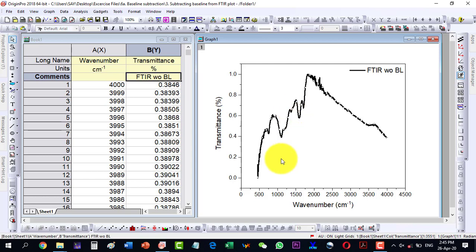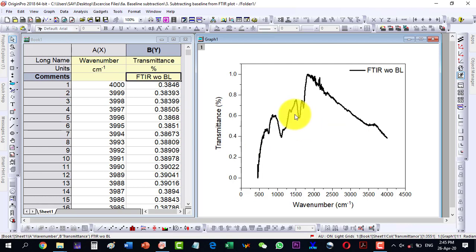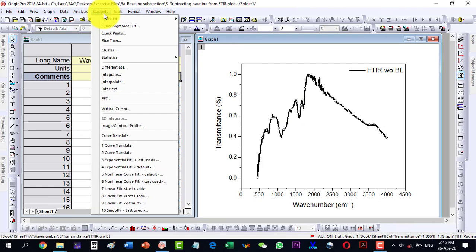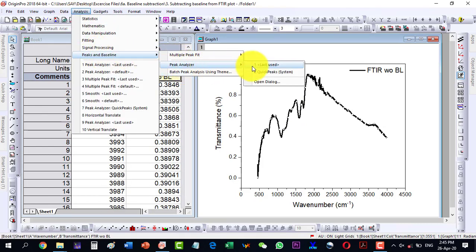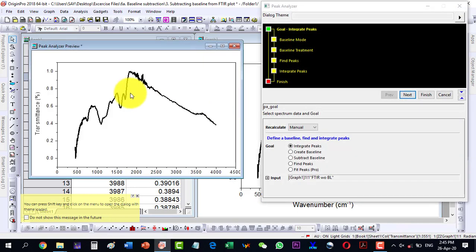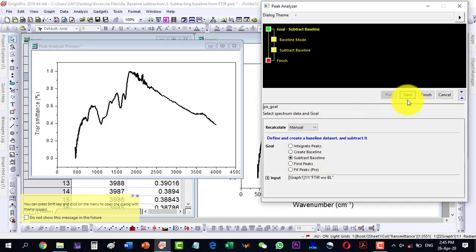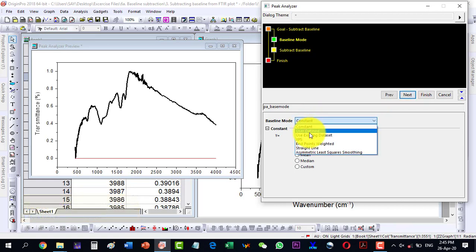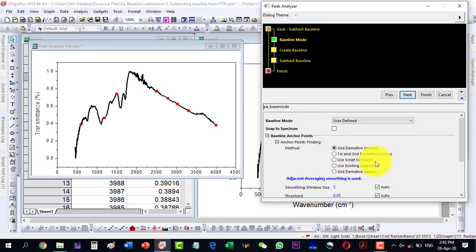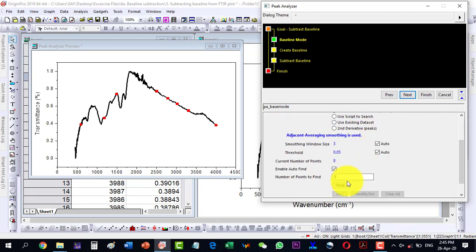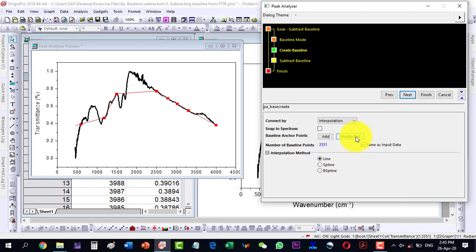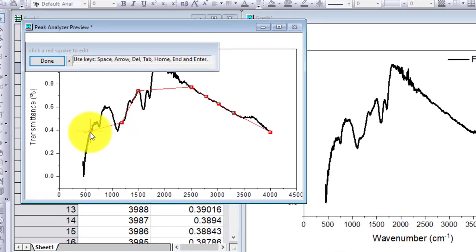Here is an FTIR plot and I would like to subtract the baseline from it so that this point and this point are on the same line. These baseline points should lie on a straight line. Select the plot, go to Analysis, then Peaks and Baseline, then open the dialog. I select Subtract Baseline, click Next, choose user-defined mode — it has already selected eight points, but I will need to modify them.